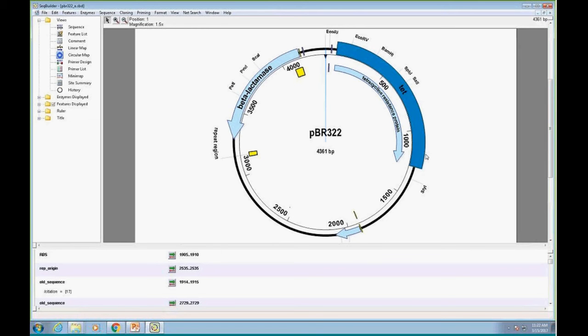you see that a lot of features are just flat out missing, or they're in wrong coordinates, and we correct them manually and go through and make sure that they're accurate. Now we have an auto annotation tool. We can apply the auto annotations and improve them in batches.